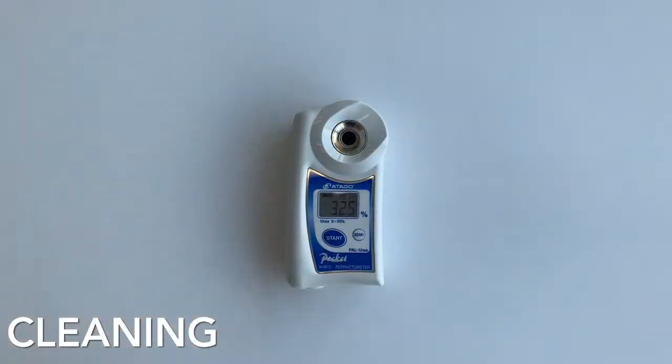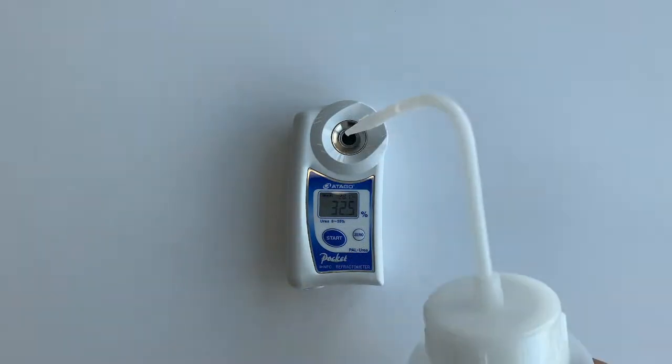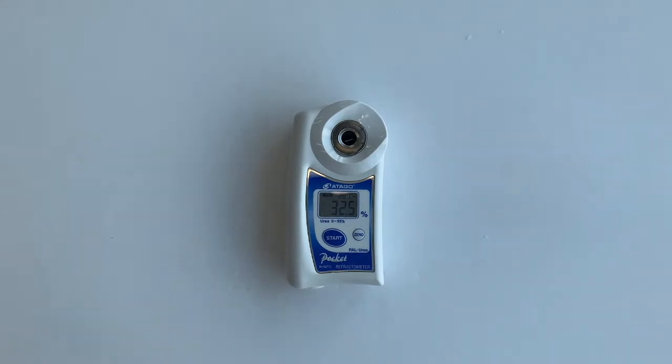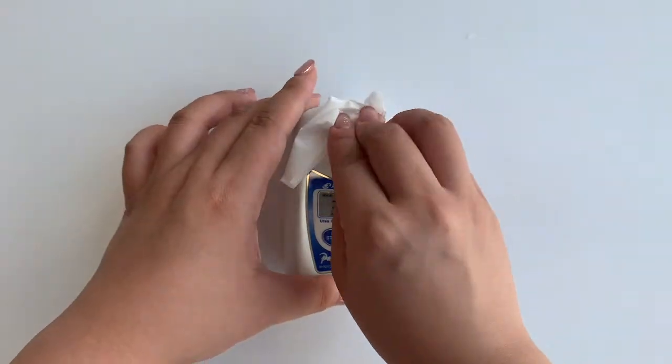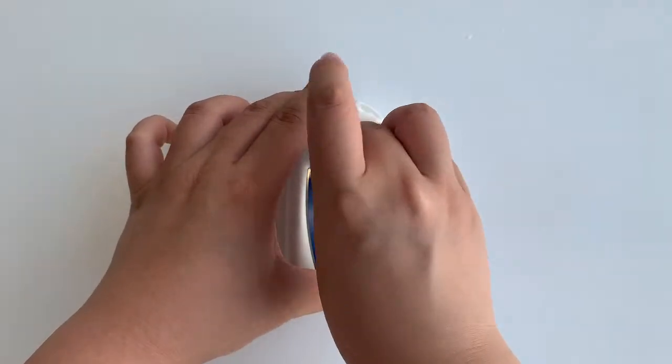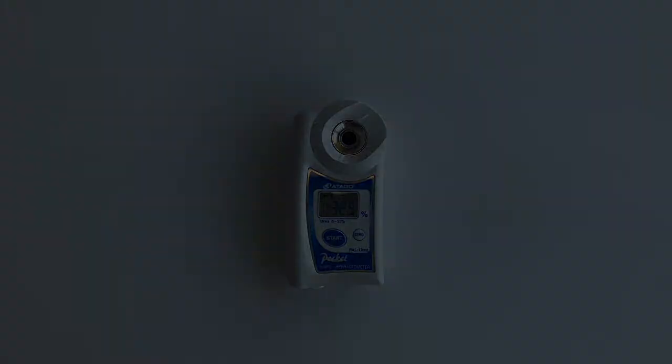For the cleaning after the measurement, make sure to clean it with water. You don't want to leave any samples, or in this case any ureas, on the sample stage, because if it dries out and builds up on the sample stage, it will affect the measurement. If you want to wash it by running water, that is possible too.